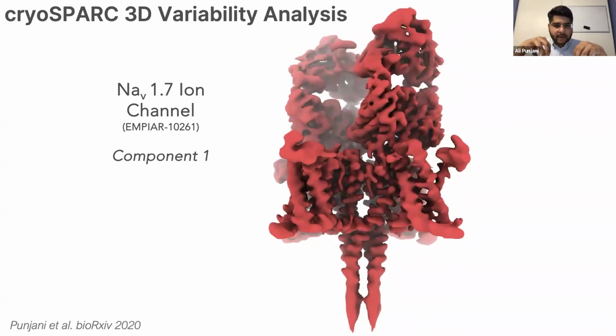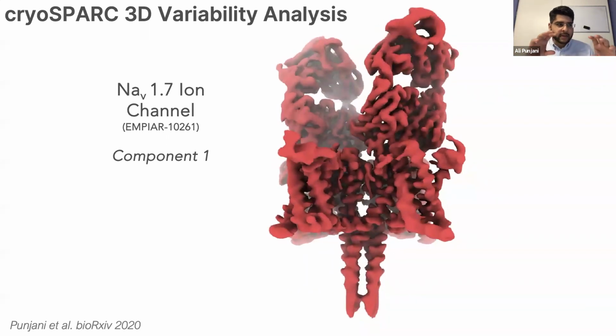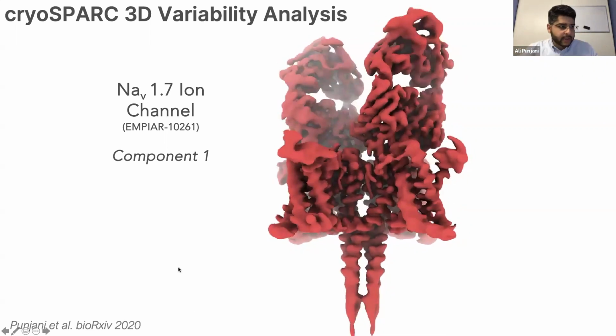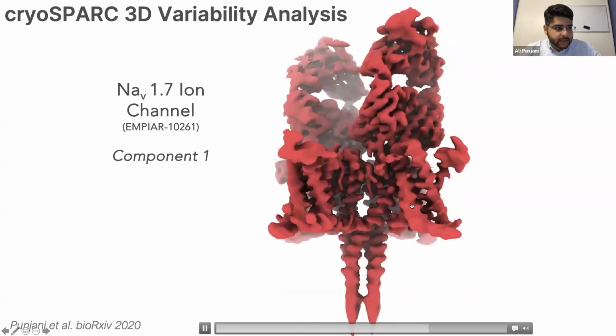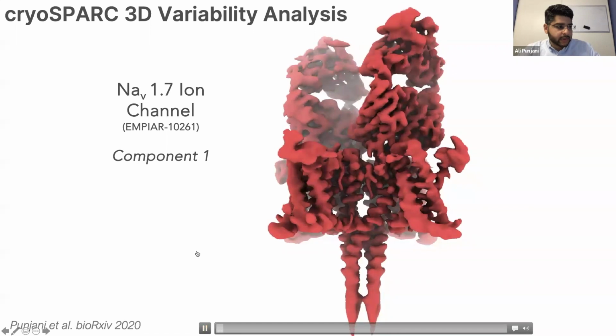And those two fabs are bound tightly to two of the subunits. The protein is actually fourfold symmetric, but there's only space for two fabs. So the two fabs are bound to two of the subunits, and it's actually the bending of the transmembrane helices and their motion by several angstroms that allows the fabs to bend. And that motion explains why the resolution of the structure in the peripheral regions of the protein is so poor in the reconstructions that we have so far.